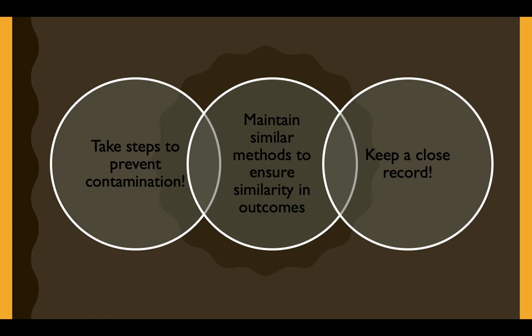Another thing, you want to pay close attention to the time. You don't want to leave your cultures in the incubator for too long, and just make sure to keep accuracy in your measurements. Like use the same ruler, because sometimes they vary by just a little bit, but that can throw you off your measurements. And the same with other materials. If you're going to use them with each one of your cultures, make sure you sanitize them in between. And yeah, keep the same materials because you want to ensure similarity in all your outcomes.